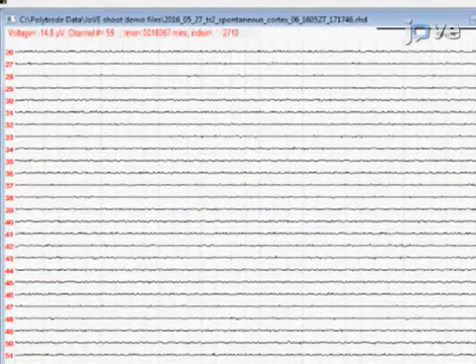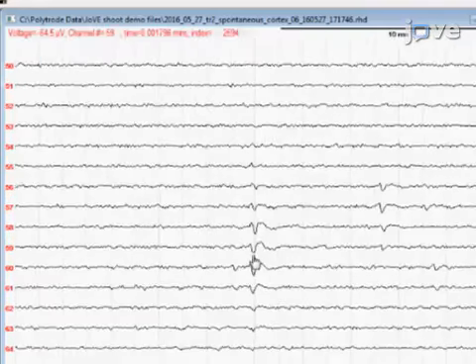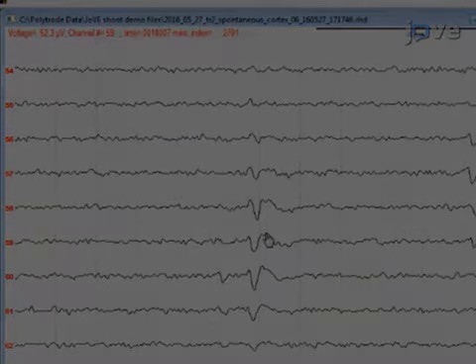Voltage signals can be inspected by holding down the left mouse button and then dragging. Use the scroll wheel to zoom in on particular features and out again. Hover the mouse over specific waveform.